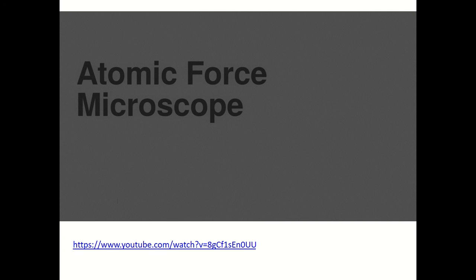Everyone, in the previous video we have seen the principle, construction and working of the scanning tunneling microscope. And in the same video, I told you that G. Binnig had developed another tool, that is the atomic force microscope, in order to overcome the disadvantages of STM.